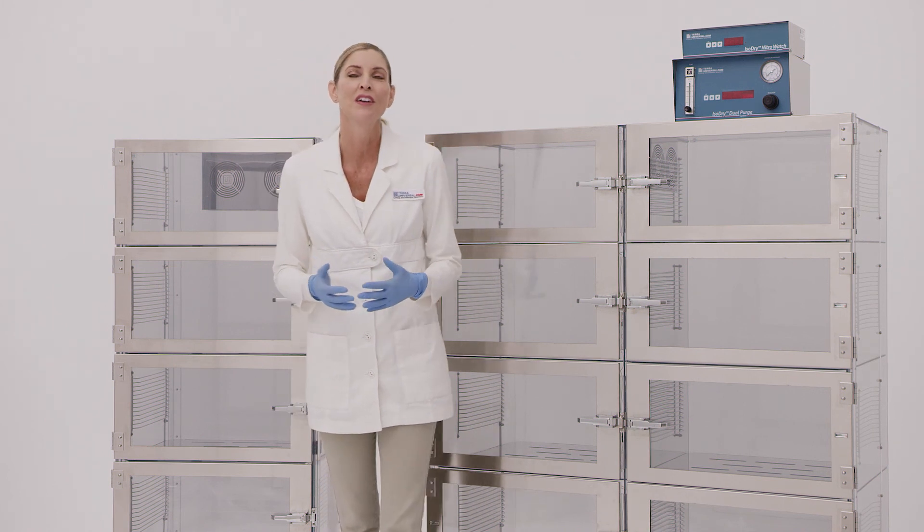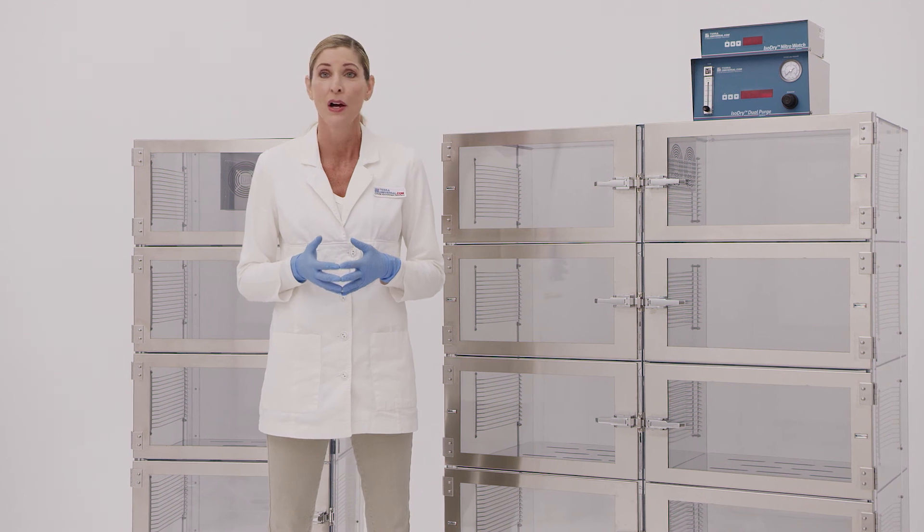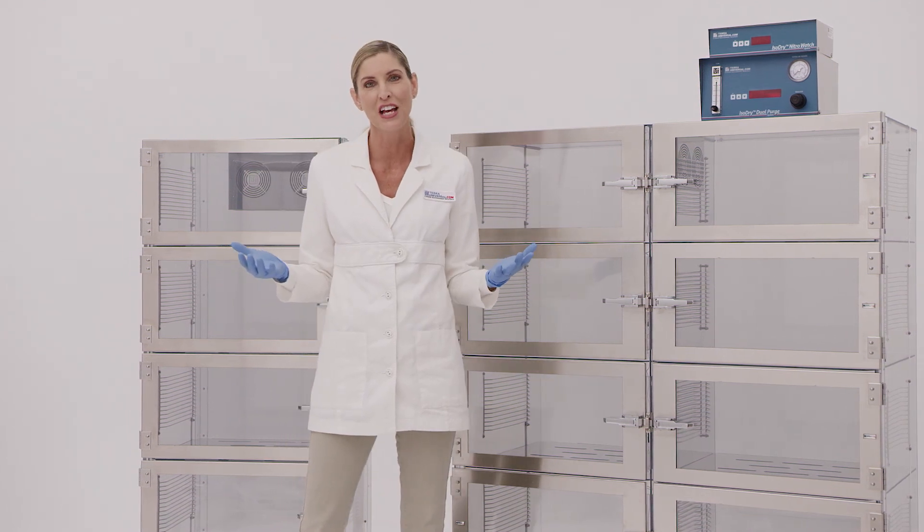To learn more, visit our website and browse our selection of ISO-DRY desiccator cabinets, or call us to speak to one of our desiccator specialists.